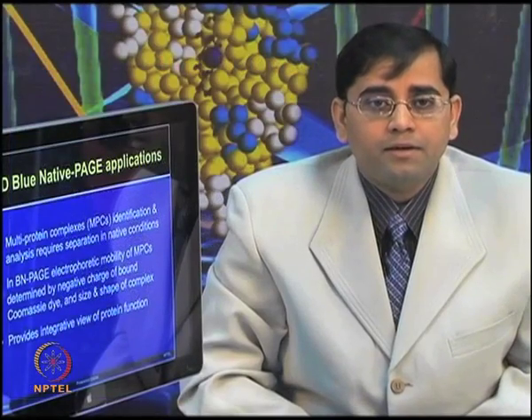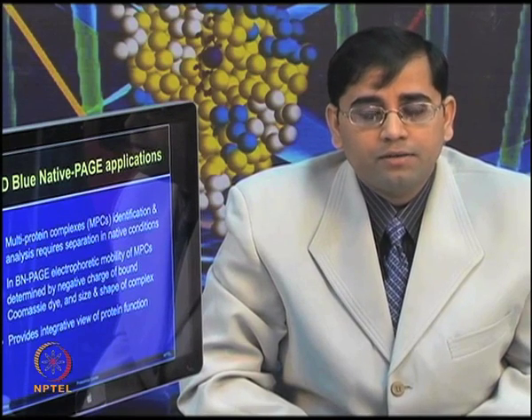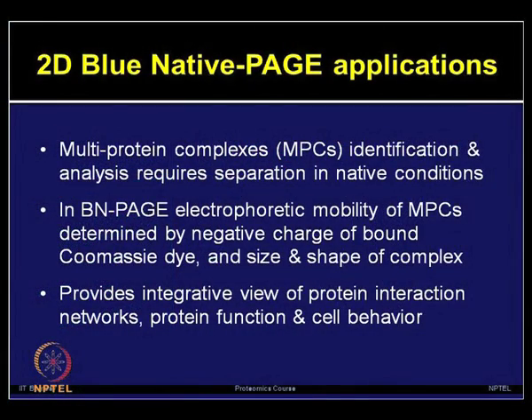People apply the 2D blue native PAGE for various applications, such as studying multi-protein complexes or MPCs. Identification of multi-protein complexes is not possible by using SDS-PAGE or a denaturing environment. So, MPCs can be identified by using blue native PAGE.